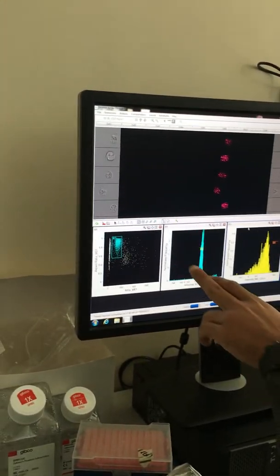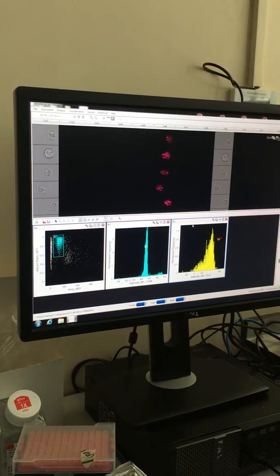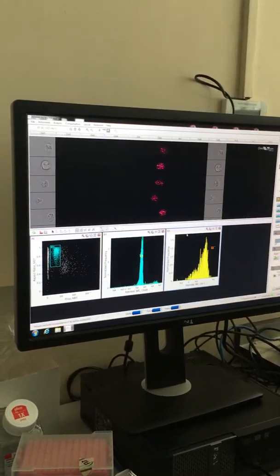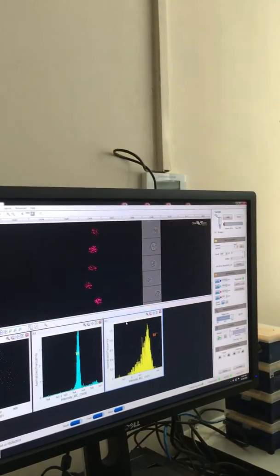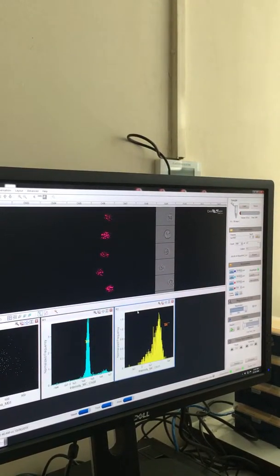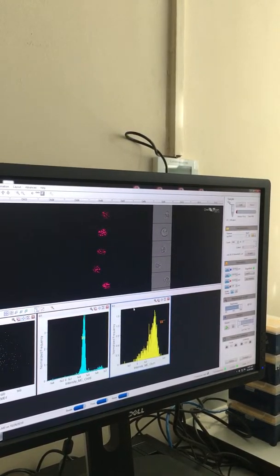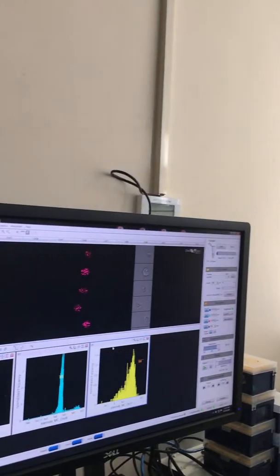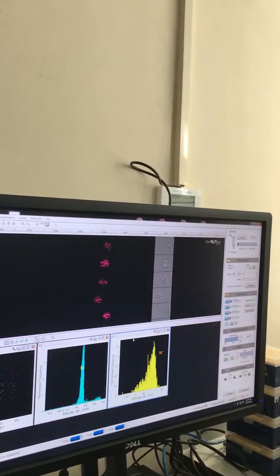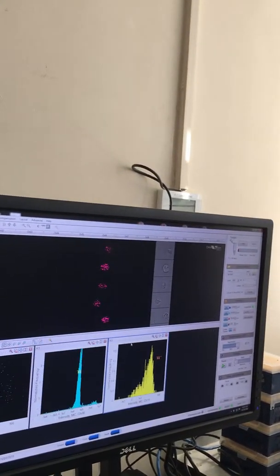So where are the dead cells going to be? It's not the same as a cytometer. The cytometer does forward and side scatter, which measures granularity, and dead cells are more or less granular, I can't remember which. They're more granular, which means you can distinguish them based on the forward side scatter profile, although not reliably. Whereas this is just looking at area, like size, so it can't distinguish between live and dead cells without a dye.